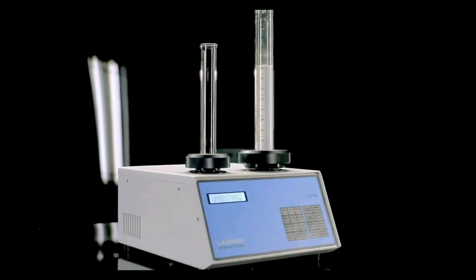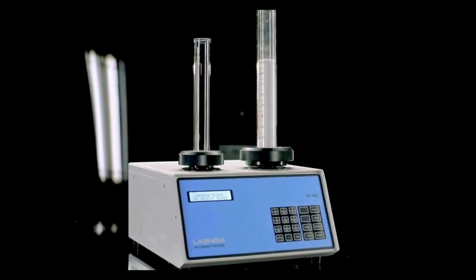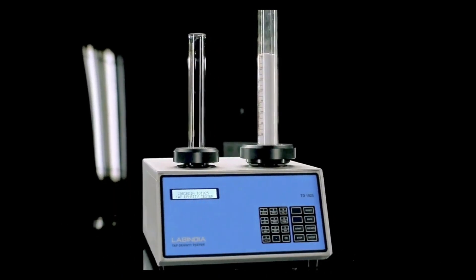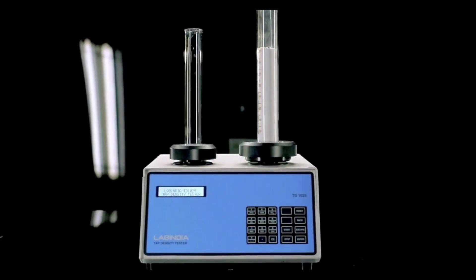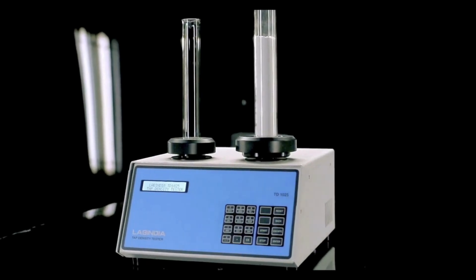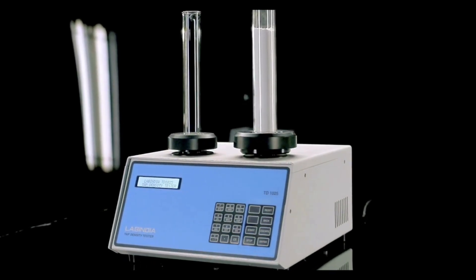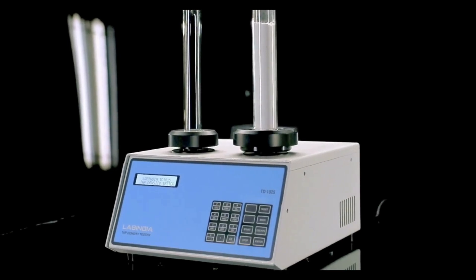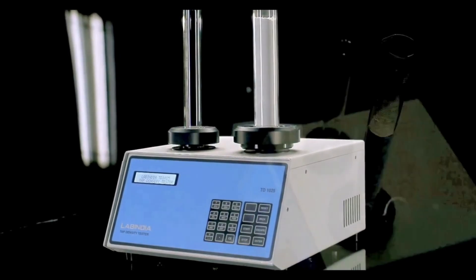If sample weight is about 100 grams or above, use a 250 milliliter measuring cylinder, otherwise use a 100 milliliter measuring cylinder. Fix the measuring cylinder into the holder provided for holding the measuring cylinder on the instrument.